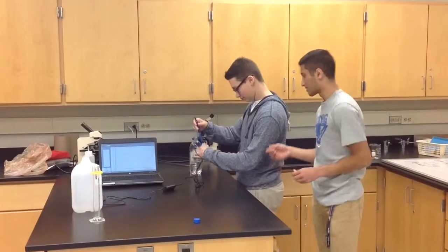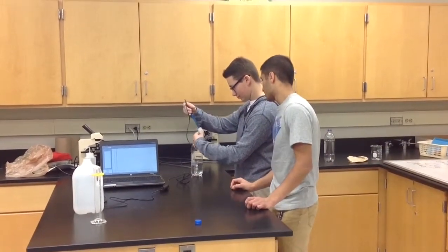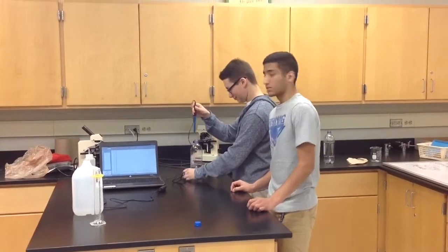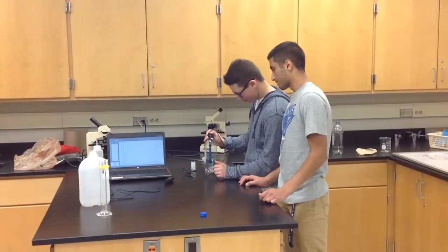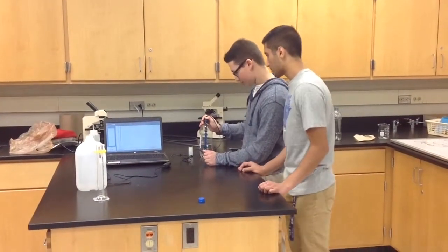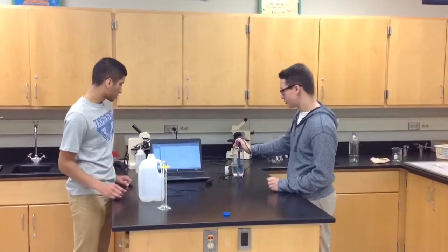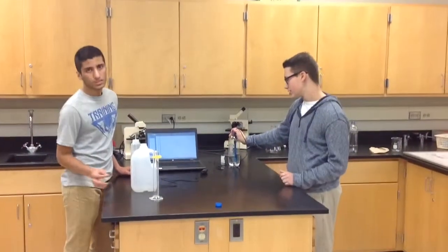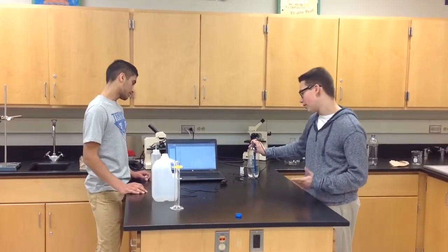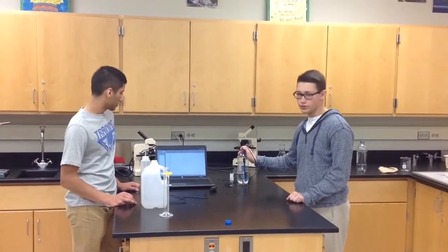Now Jacob's putting the pH meter in the distilled water to determine how much of a reduction in pH there was. Okay, so after measuring the pH, there was a slight reduction of approximately 0.4 pH, but nowhere near as much of a decrease as with the CO2.